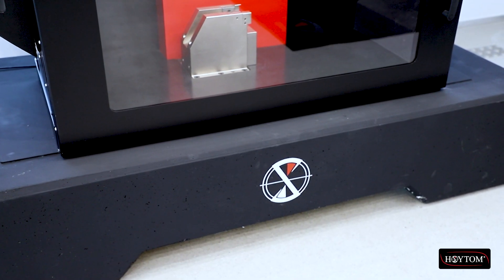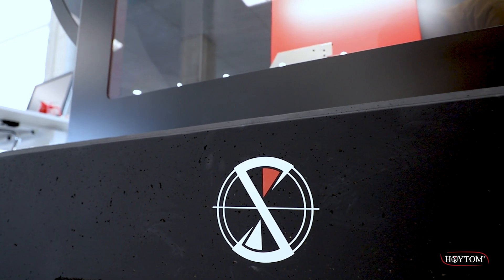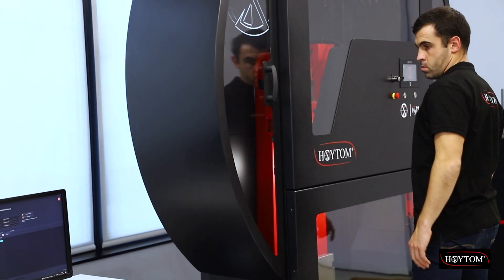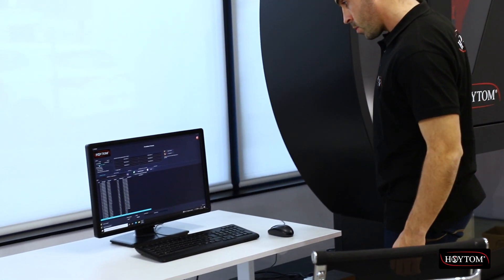All Heat Pendulum Impact Testers include a foundation base according to EN ISO 148-2 and ASTM E23, thus ensuring the correct test value.